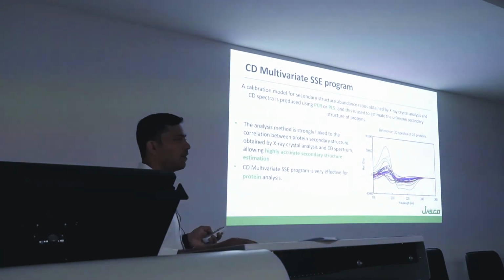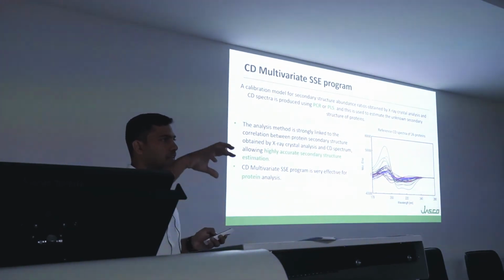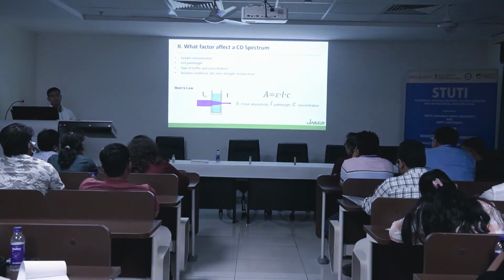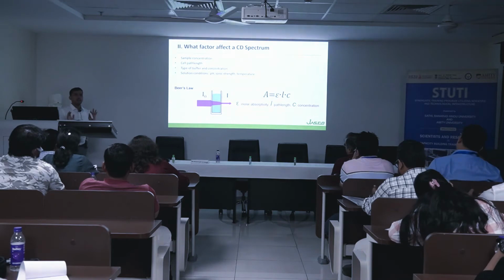But generally, why we develop this model: if you are working on this PLS model, and your protein molecule is very similar to the protein molecules already present in your libraries, then getting a good correlation will be useful for us. Once you come up with this model, the next thing is what kind of samples and measurement considerations we have to take into account.